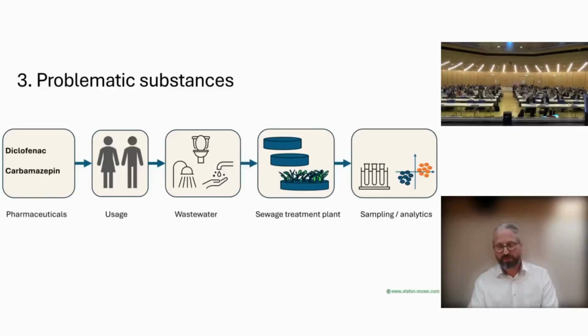They persist in the water and can accumulate in the environment, where they may trigger unexpected metabolic reactions in plants and animals. These reactions, new or altered metabolic pathways, are exactly what we are aiming to visualize through non-target screening. The challenge is that we don't know what to expect in advance, so we need systematic methods that help us explore the entire data space.